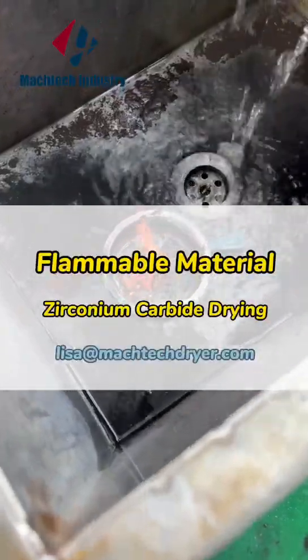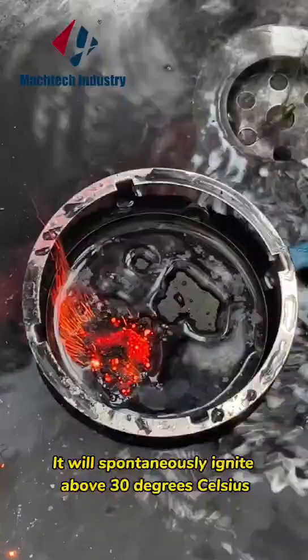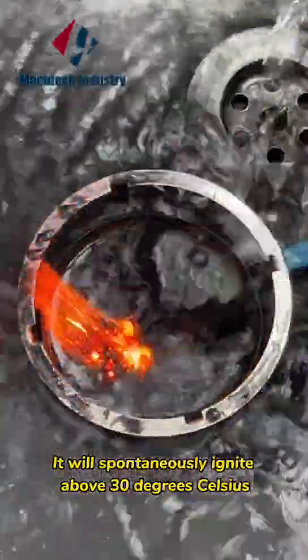Zirconia Carbide Drying. It will spontaneously ignite above 30 degrees Celsius.